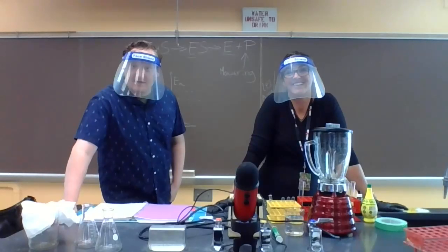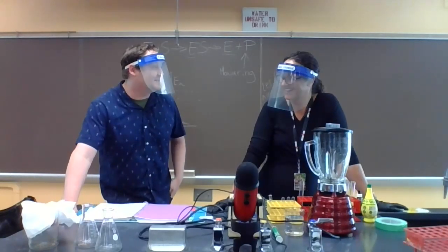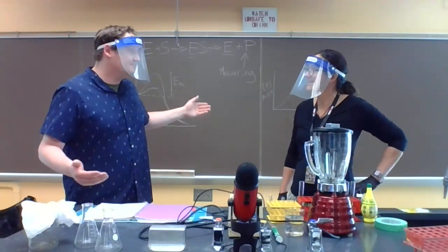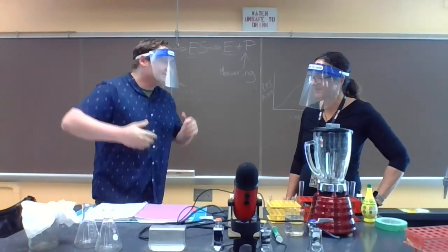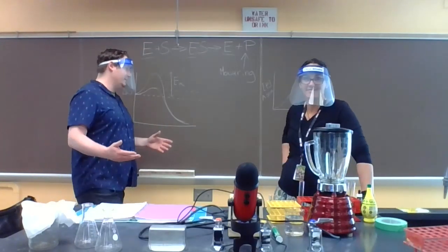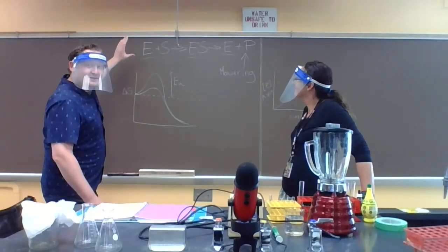Today we're going to be working on the lab Enzyme Kinetics 1. In Enzyme Kinetics 1, we're going to be looking at varying concentrations of an actual enzyme and looking at the effect that has on reaction rates. So we've probably already talked in lecture about this, but the general equation for an enzyme catalyzed reaction is as follows.